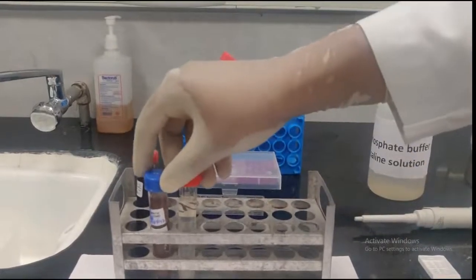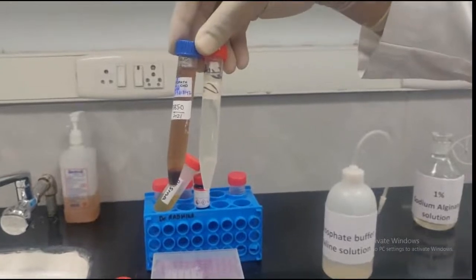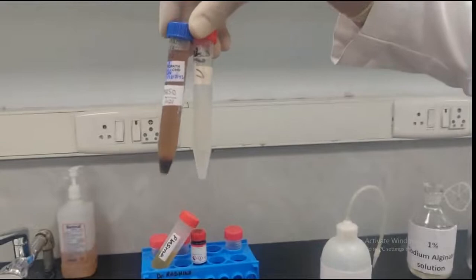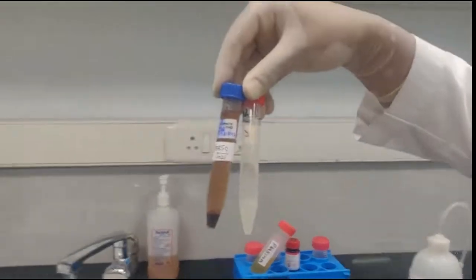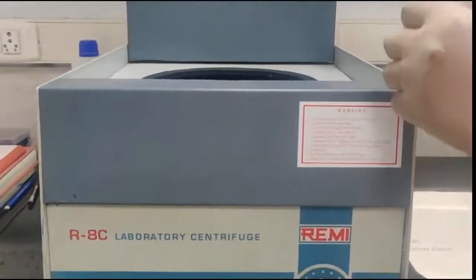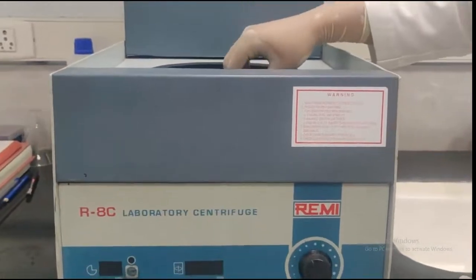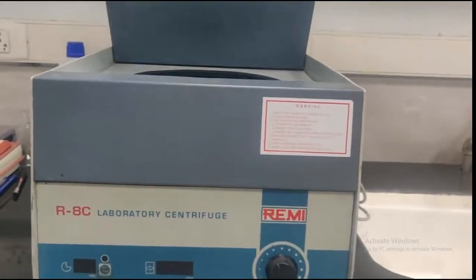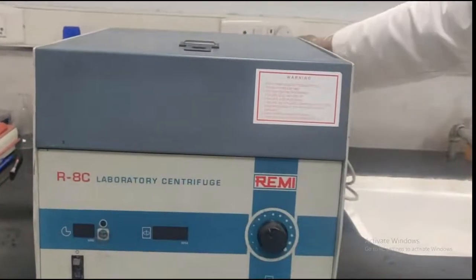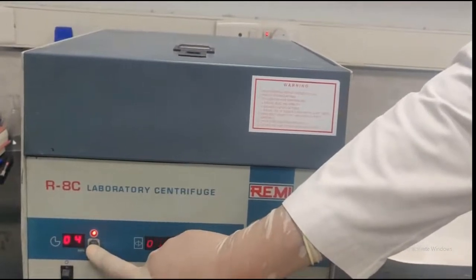So now we have to centrifuge these pellets so that all the material that has been suspended in the supernatant settles down at the bottom. So now we will centrifuge these tubes at 1500 RPM for 10 minutes, or we can centrifuge them at 3000 revolutions per minute for 5 minutes. So now centrifugation has to be done. This is the centrifuge, a desktop, tabletop centrifuge.